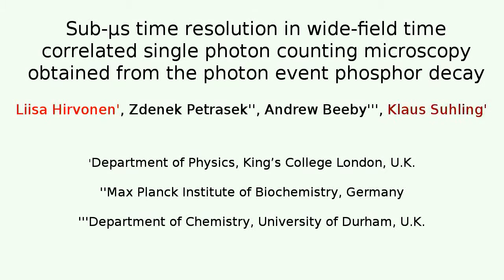Me and Klaus Suhling will tell you about our work with Zdeněk Petrášek and Beeby on time-correlated single photon counting microscopy with an image intensifier and ultra-fast camera. Photon counting imaging was originally developed for astronomical applications, but this technology can also be used in other fields.